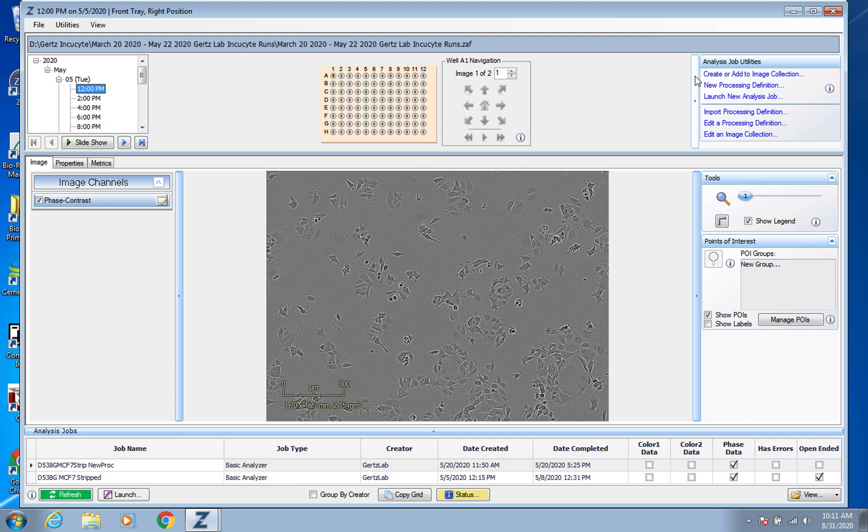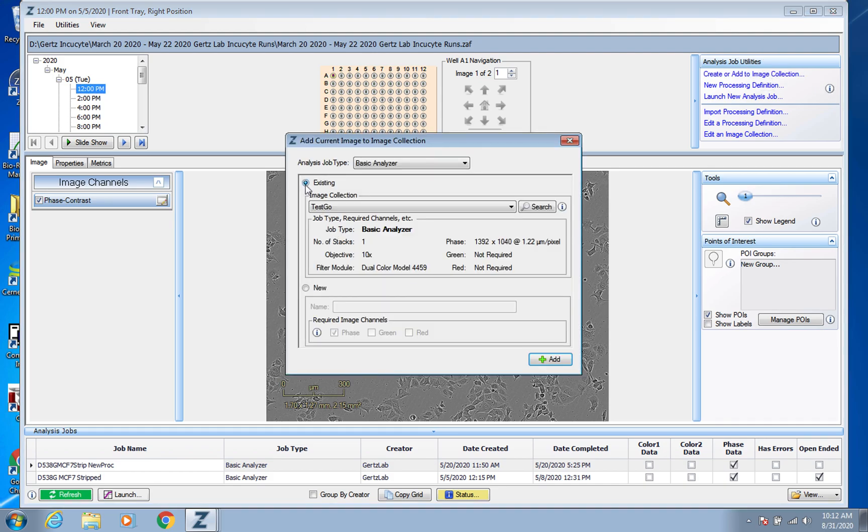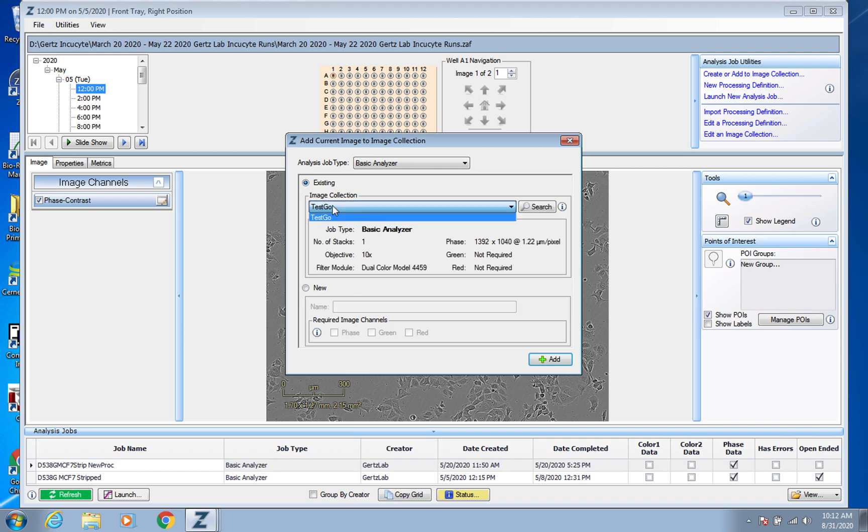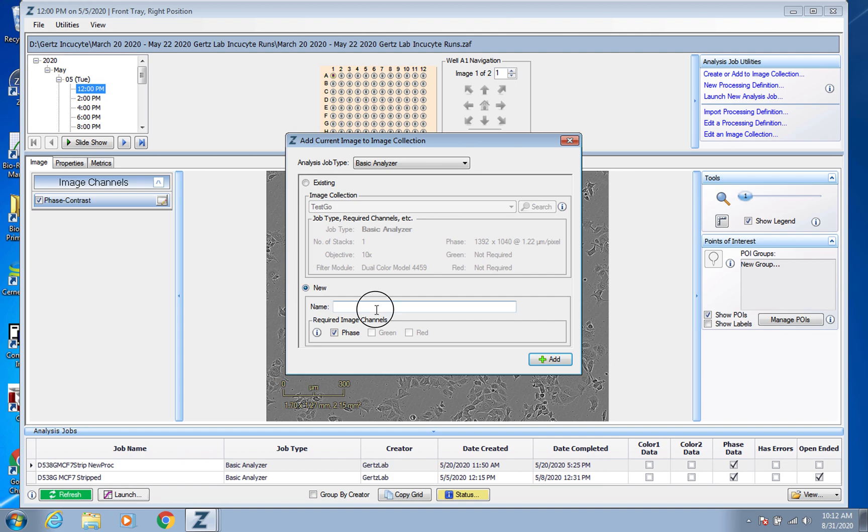So what you'll need to do first is actually create an image collection. So in the top right here, you're going to go to create or add to image collection, and so you can see that you can do some test ones. So normally there would be more if you weren't within the archive, but because we're in the archive, it's just this one. But that's fine because normally you'd be needing to create a new one anyway. So we're just going to call this display test.